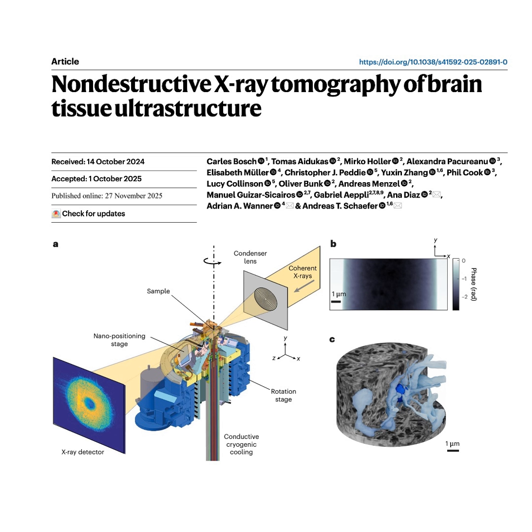So what was the winning material? It's a low-viscosity epoxy called TGPAP. And to understand why it's so tough, you really have to look at its molecular structure compared to the standard EPON. Okay, try and simplify the chemistry for us here. I'll try. So both EPON and TGPAP are what we'd call trifunctional. They have 3 epoxy groups, which lets them form a really robust cross-link structure when they cure. That's where the strength comes from.